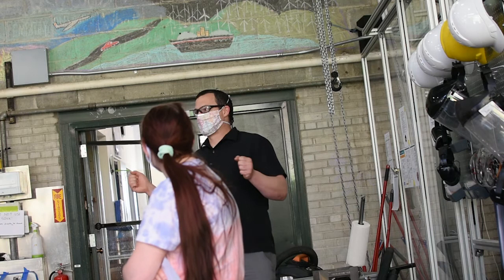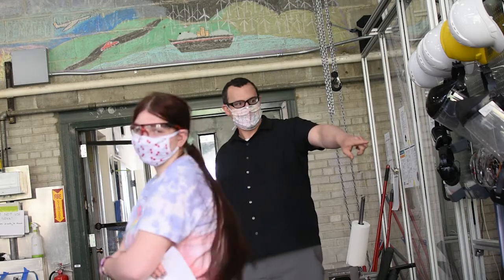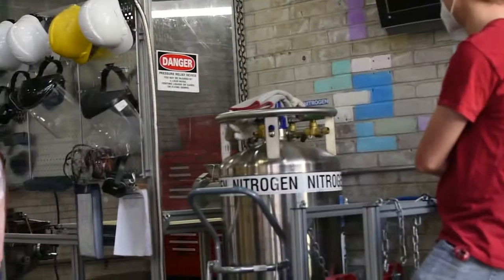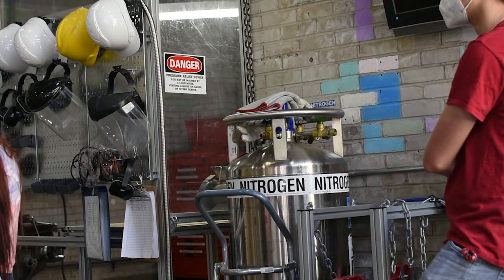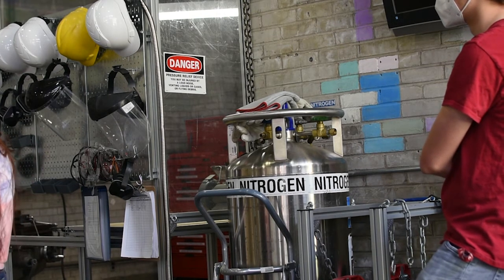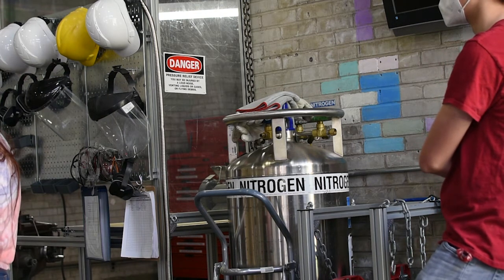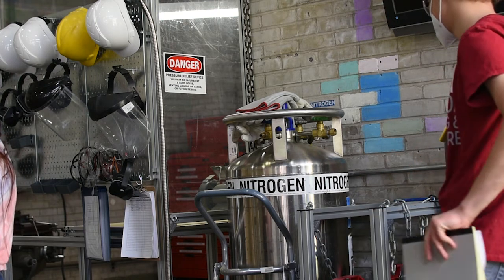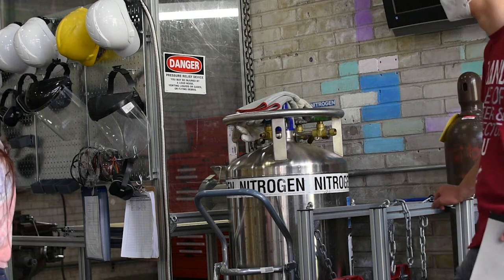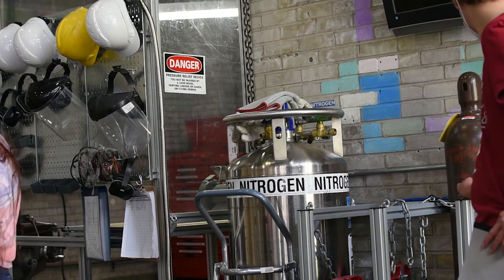At Berkeley, they had one of these big dewars. Somebody was trying to take it across a grassy area, and it slipped, rolled down to the bottom of the stairwell and burst open at the bottom of the stairs. People were trying to come in there to be heroes to try to stop it and tip it back upright. Imagine all of that in the bottom of the stairwell. That could displace all the oxygen in there real quickly. You're not a hero if you're face down in that, having to be saved by somebody else. This is a very real thing that people continually run into problems with all the time.